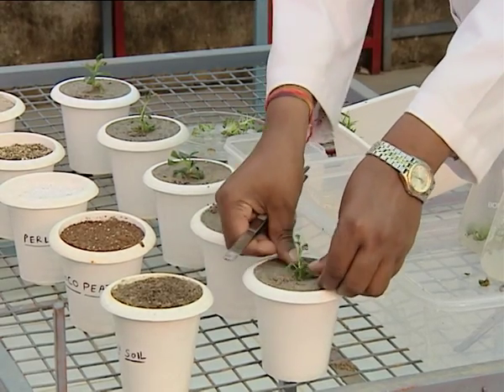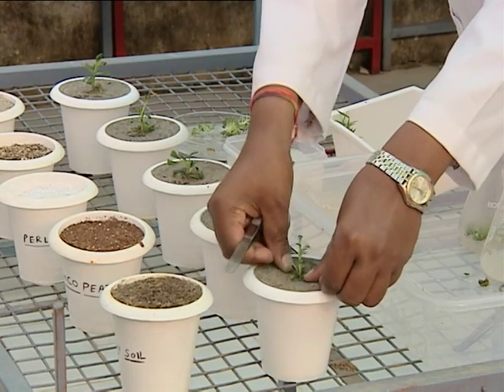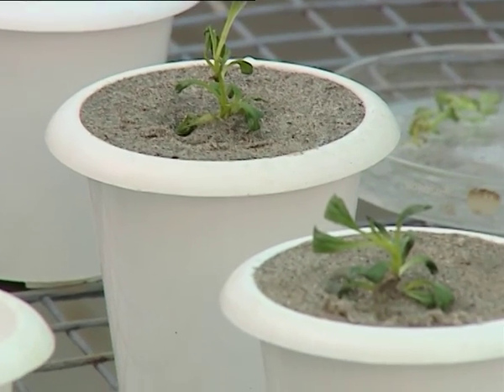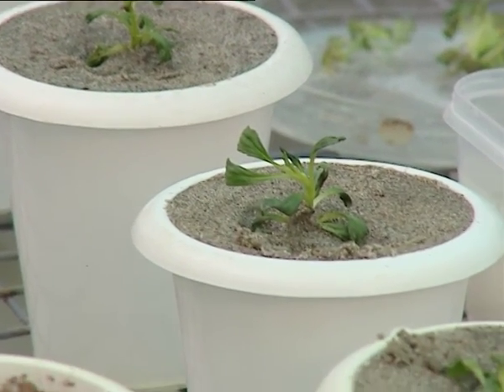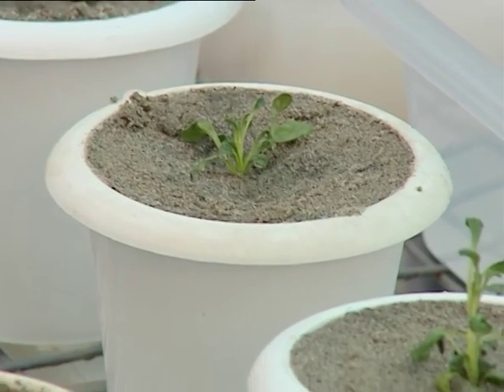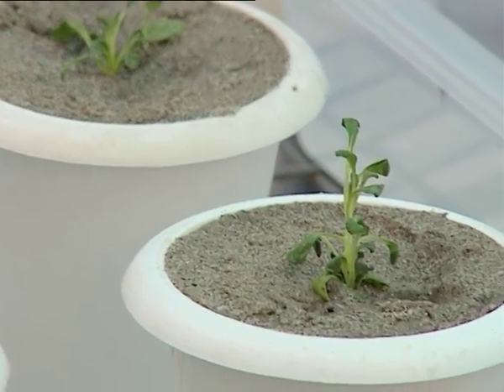After rooting and growth of plantlets up to 3 to 4 inches, shift these to a potting mixture containing garden soil, sand, and well-decomposed farmyard manure in the ratio of 1:1:1.